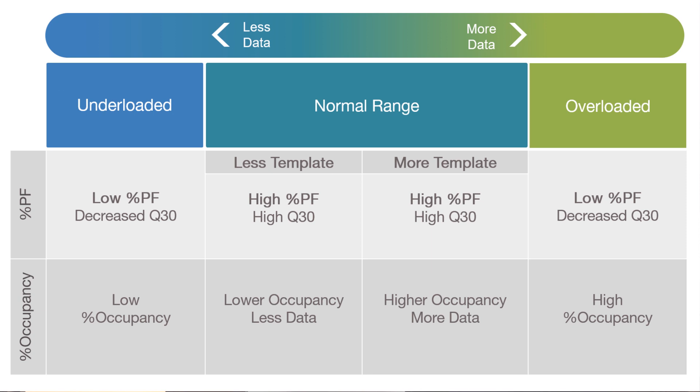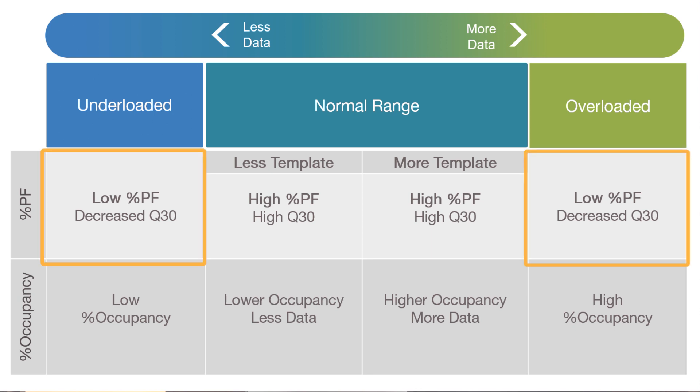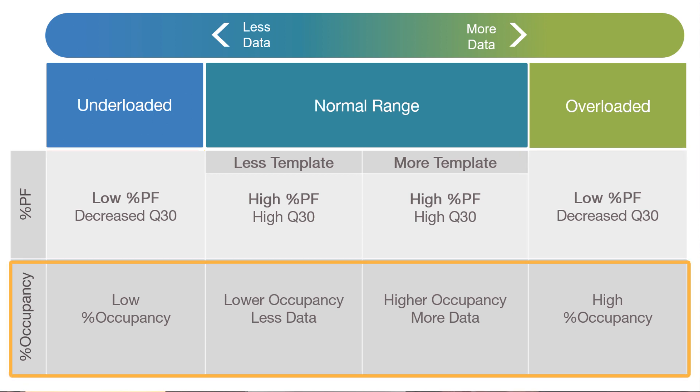Percent occupancy is a key metric. Percent passing filter will be too low in both over- and under-loaded situations, but percent occupancy will help tell the rest of the story.